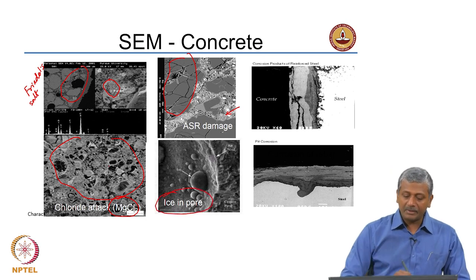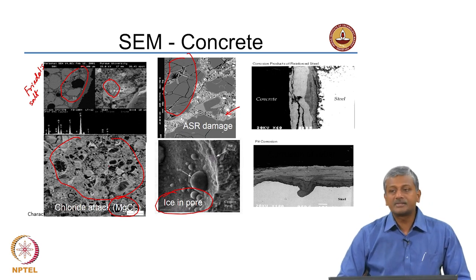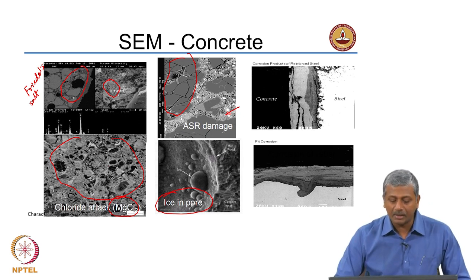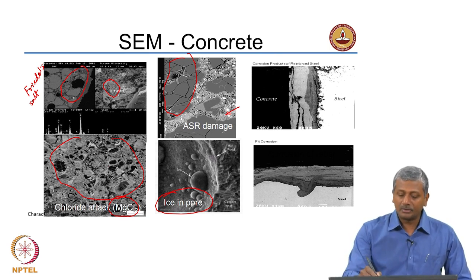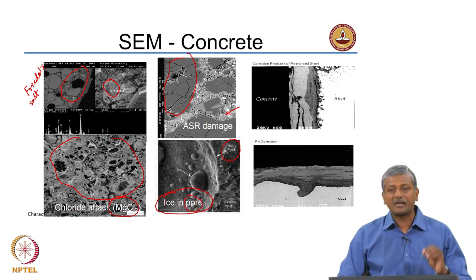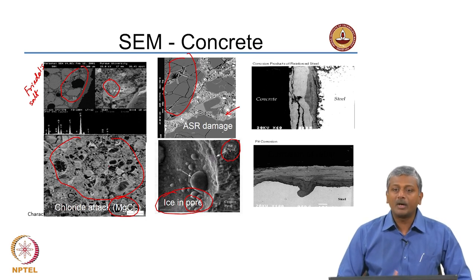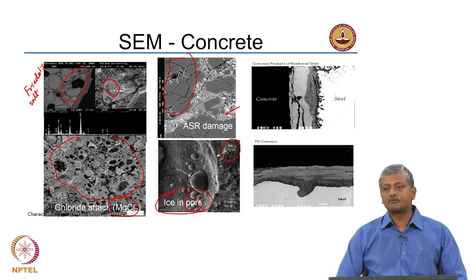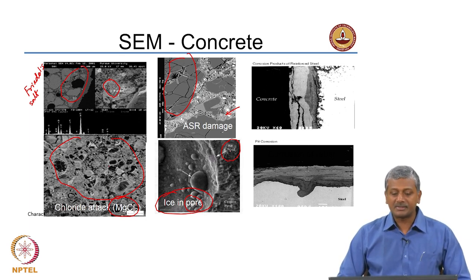This is a very interesting image. It is a secondary electron image because you can actually see the spherical ice crystals that have lined the inside of an air void. This is a large air void lined by ice crystals. We do air entrainment in concrete to ensure there is space for water to transform to ice, so ice should be forming inside the air voids — and this image very nicely shows that ice formation inside air voids.